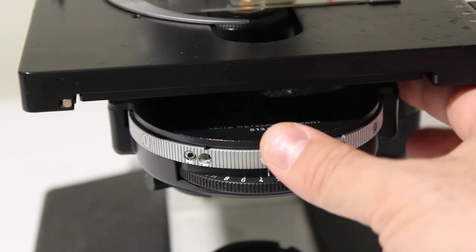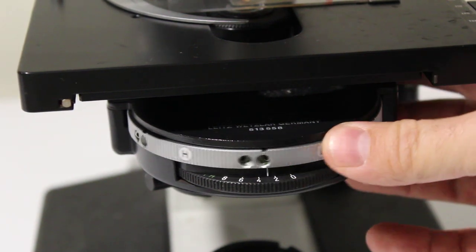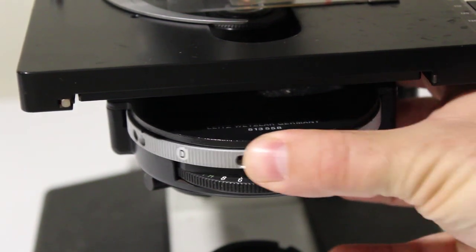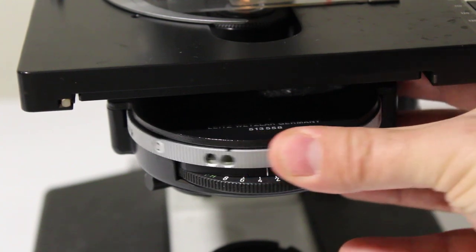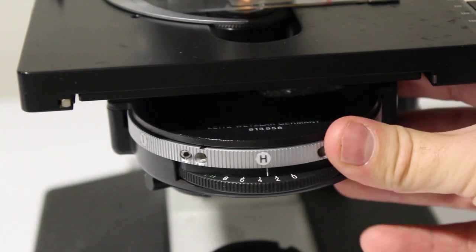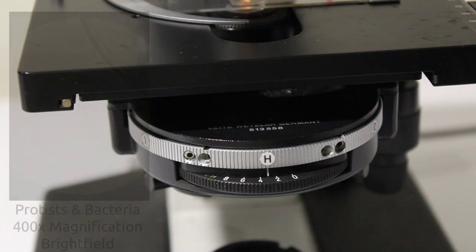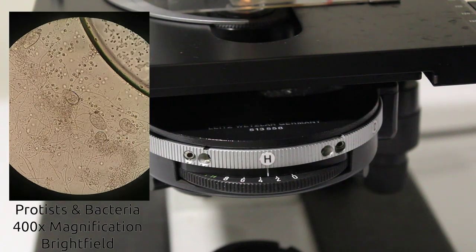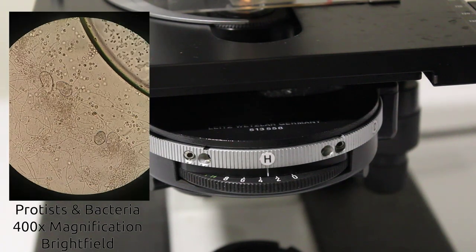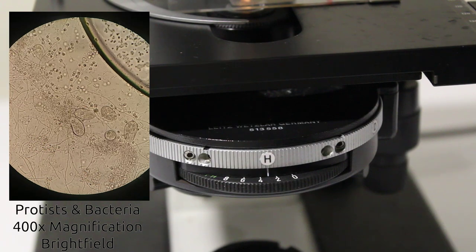The main difference that my condenser has is this rotating ring. This rotating ring allows me to switch between different imaging modes that let me have different views of the sample on the stage. So the setting I have here indicated by the H is called bright field mode. This would be what you would have on an Abbe condenser so the images you would see here are going to be equivalent to what you would see on an Abbe.